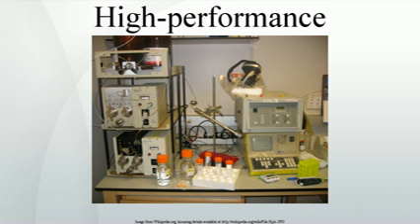The choice of mobile phase components, additives such as salts or acids, and gradient conditions depends on the nature of the column and sample components. Often a series of trial runs is performed with a sample in order to find the HPLC method which gives adequate separation.